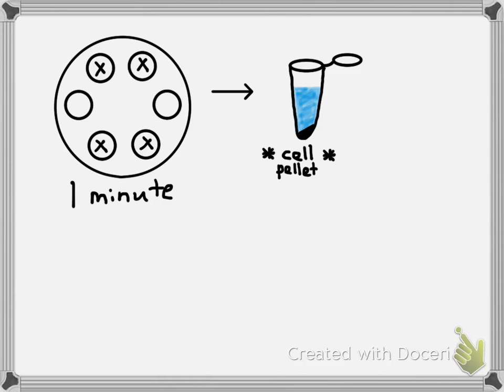When you remove your tube, you should be able to visualize the sacred cell pellet. This cell pellet is now the center of your universe. Hold the tube up to the light and make sure that you have a pellet. If you're not sure, call me over.